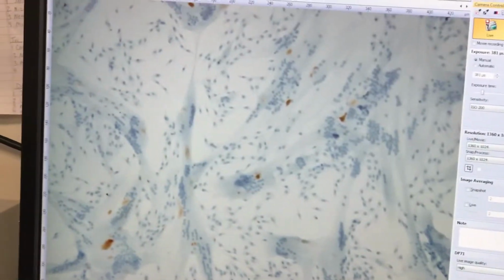So Bruce can now show you this RNAscope image. You can see the nuclei here. These have been fixed and are on a slide now. They are FSHD patient-derived myotube cells. They were actually myoblasts derived from a patient that we differentiated in vitro into myotubes. After that, we looked for DUX4 messenger RNA with custom-designed probes that we have for this messenger RNA.